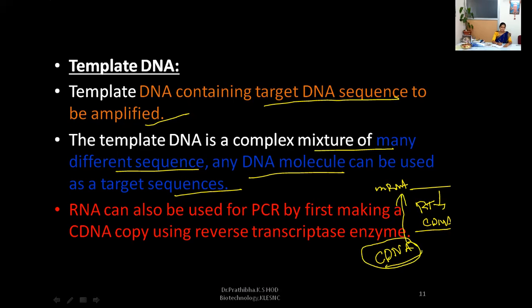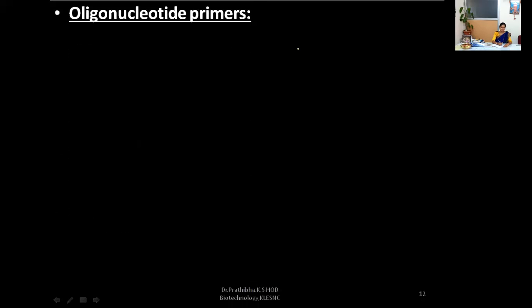So what is template DNA here? Template DNA contains the target DNA. Also, we can say template DNA is single-stranded DNA. Template DNA is a single-stranded segment or single-stranded DNA molecule.